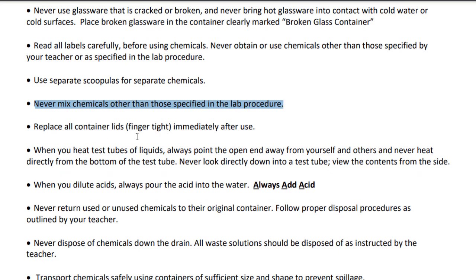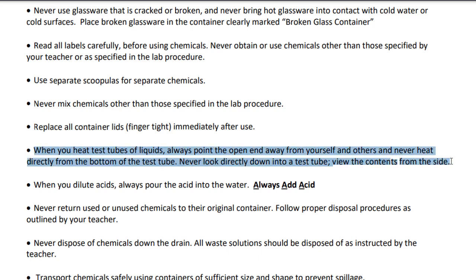And then make sure that if you are taking something from the front and it has a lid on it, you always put the lid back on before you walk away. Even if someone's right behind you, you make sure that you're good to have tightened the lids before you walk away.